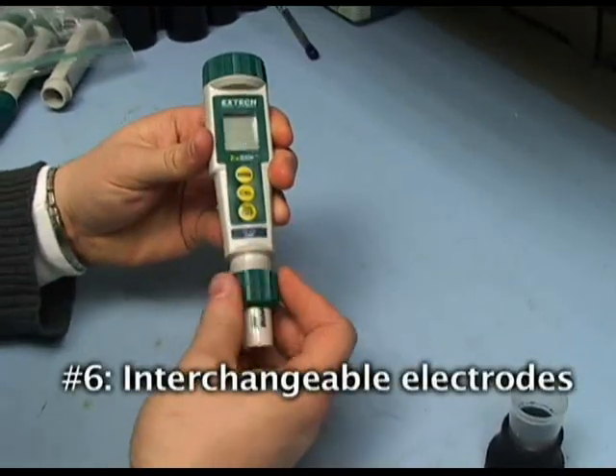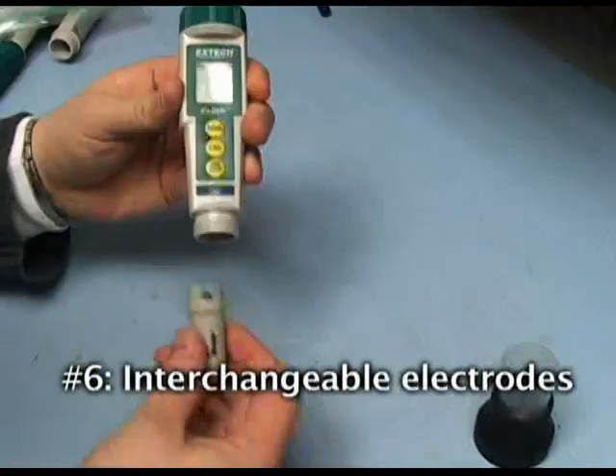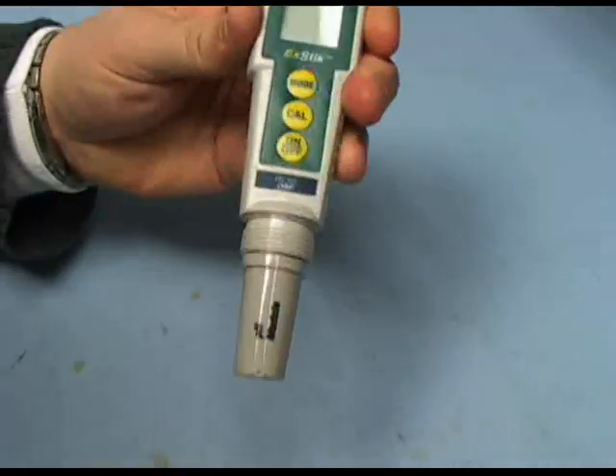6. The ExStik ORP meter allows you to measure other parameters such as chlorine and pH with its interchangeable electrode capability.